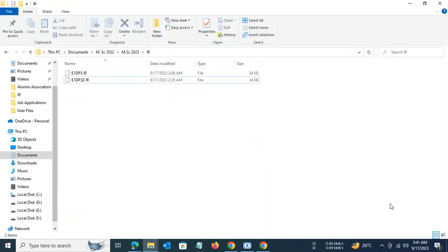Hello viewers, today I'll show you how to develop an IR spectrum from IR spectral raw data. In the screen before you are two raw data files obtained from an IR spectral measurement earlier.